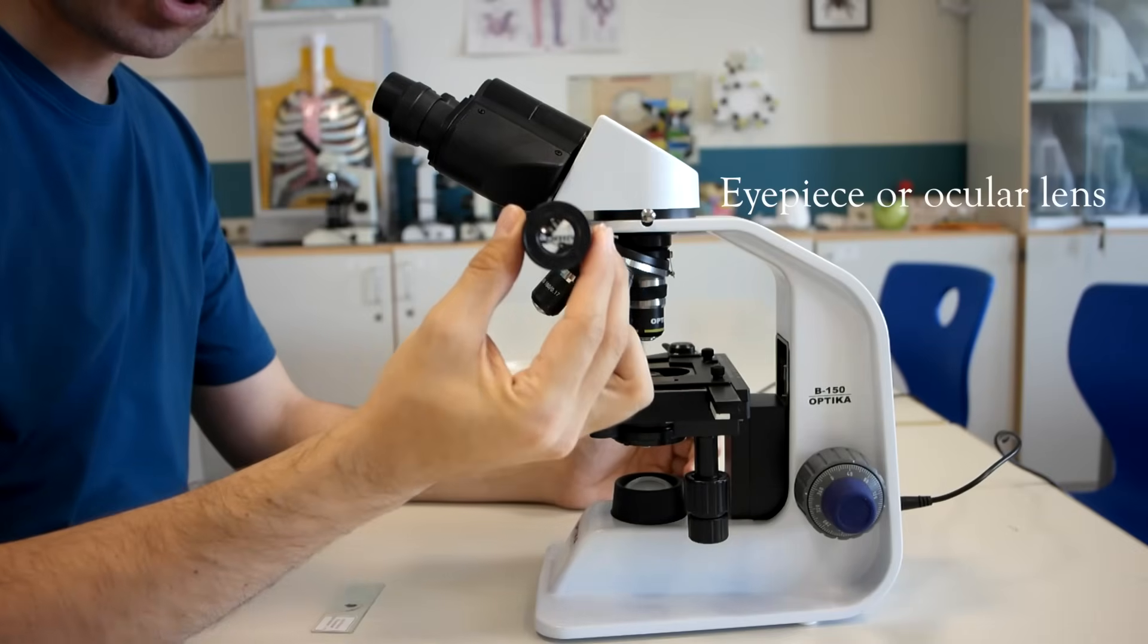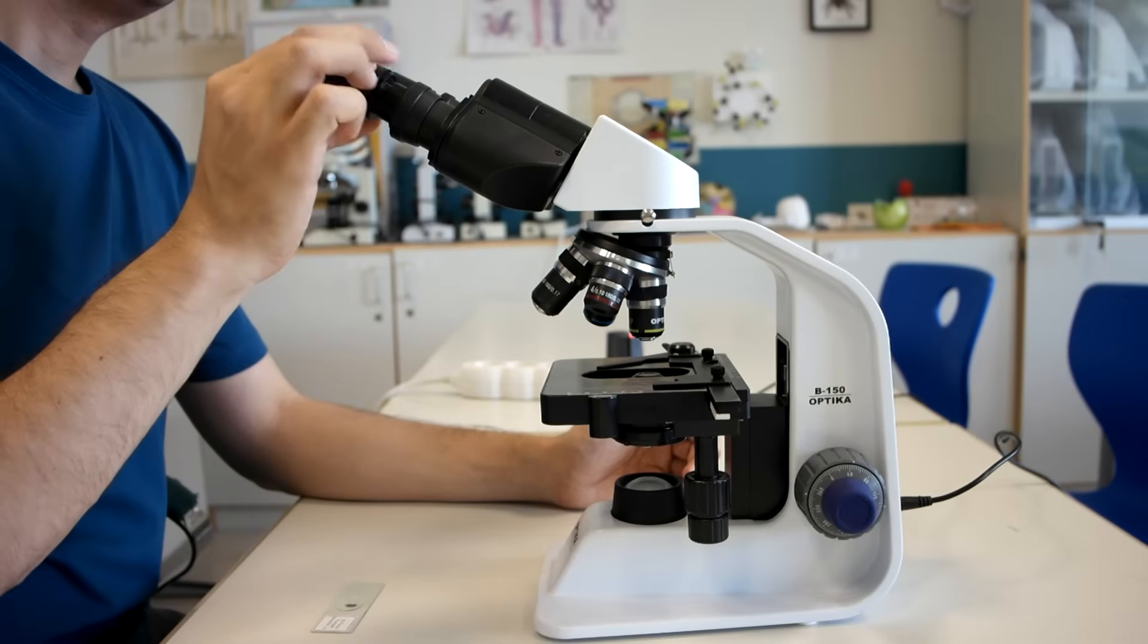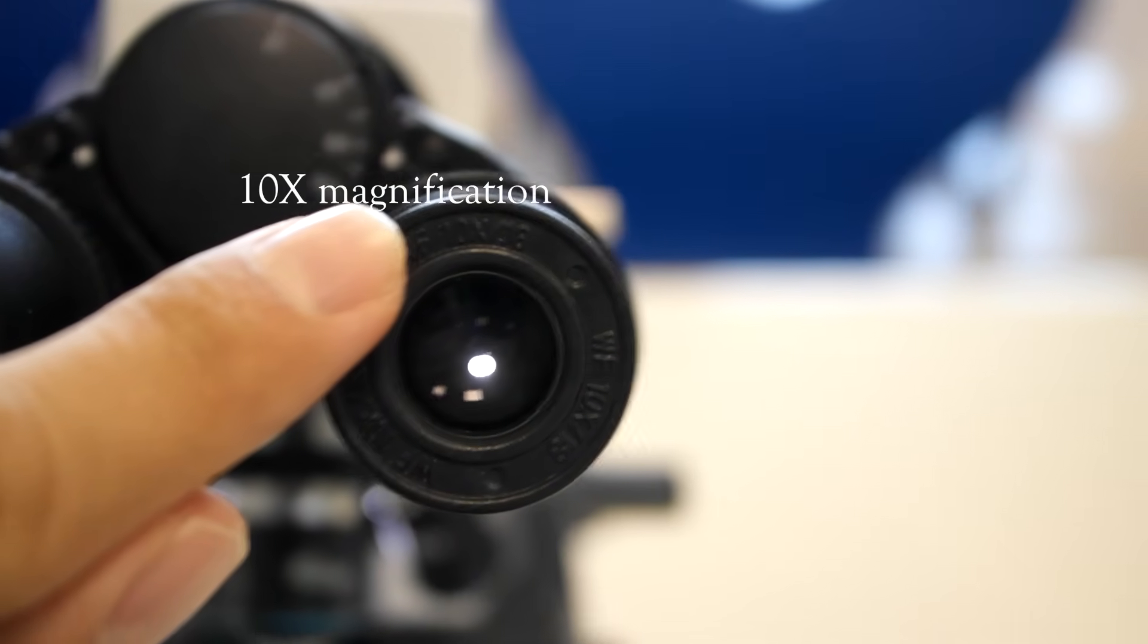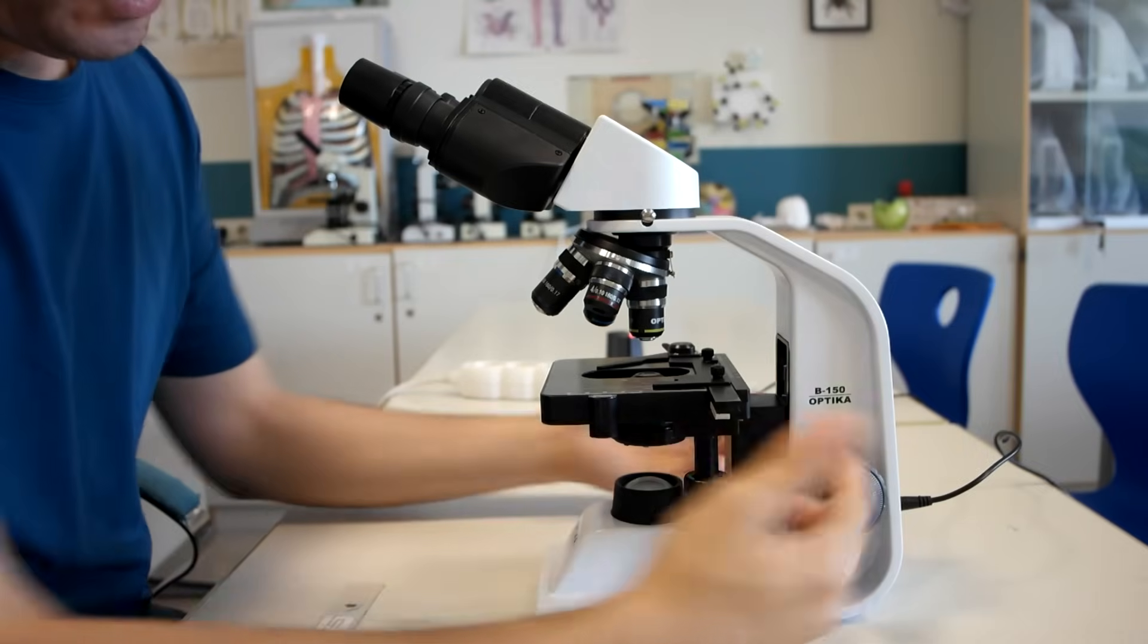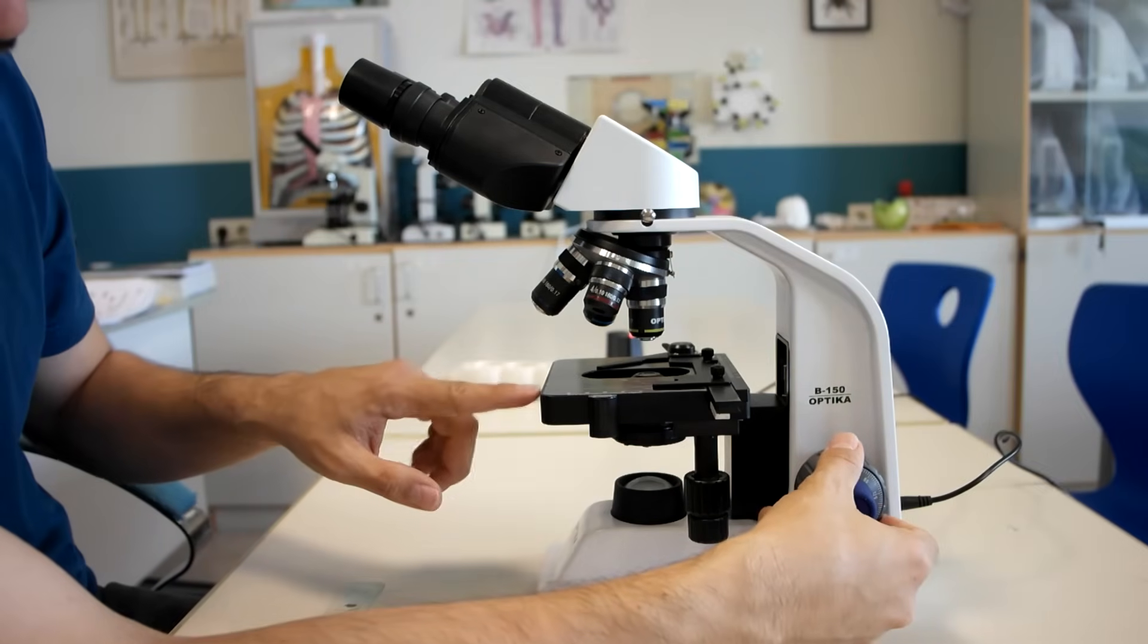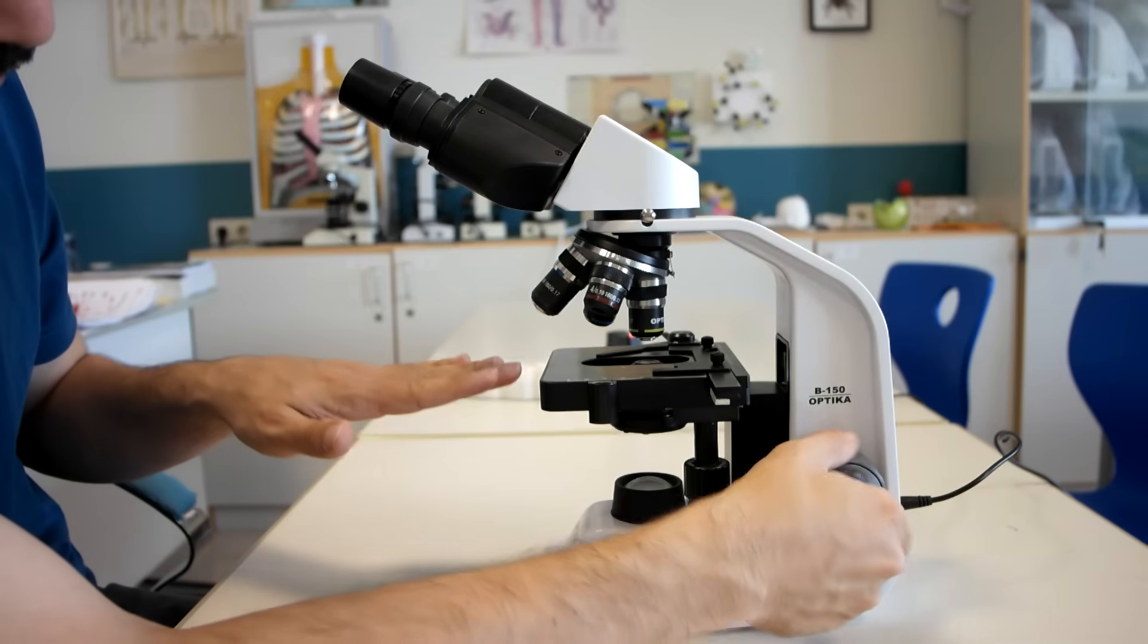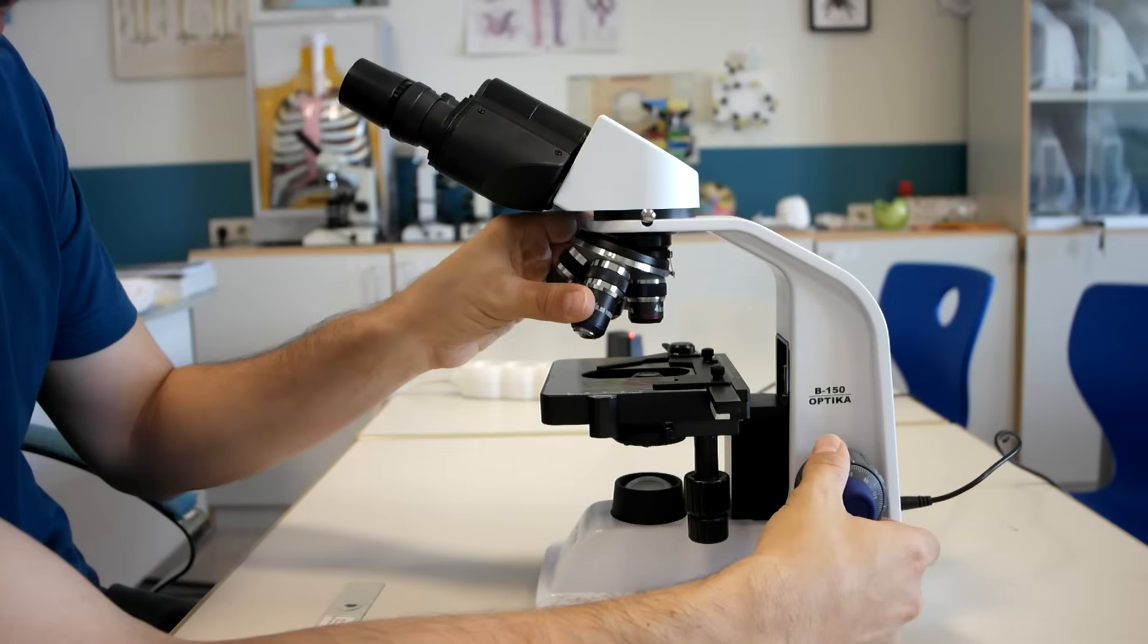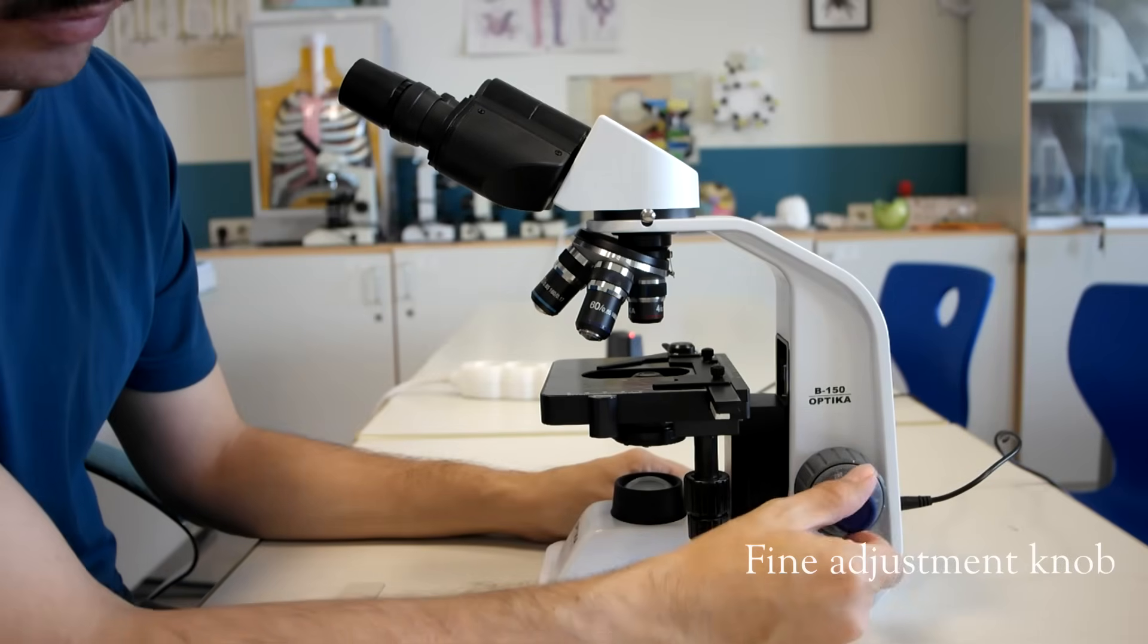Eyepiece lens or ocular lens. This is the coarse adjustment knob. This coarse adjustment knob moves the stage up and down. And this part is the fine adjustment knob.